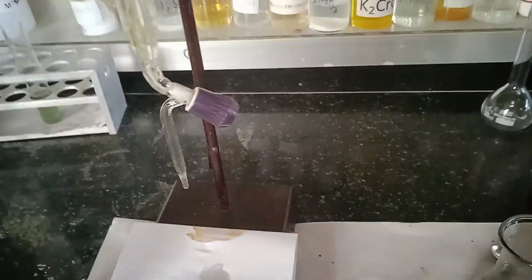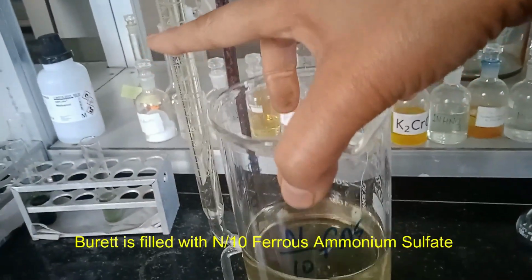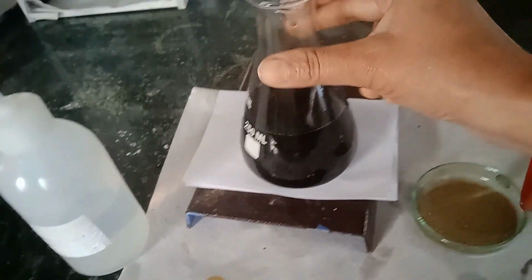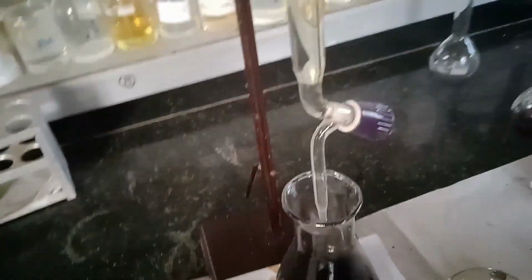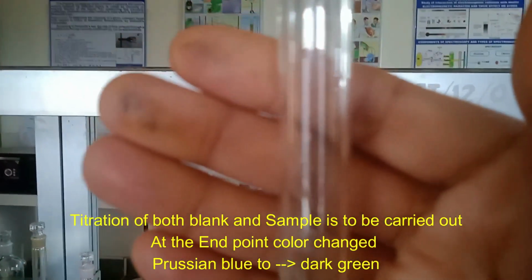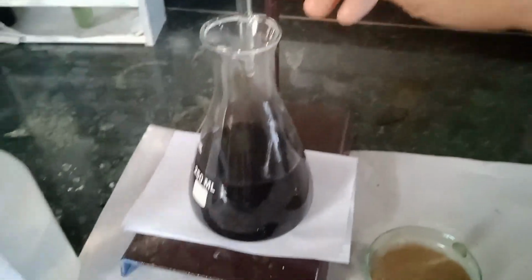For titration, I am using this burette and in the burette I have filled N/10 FAS, ferrous ammonium sulfate solution, because ferrous ammonium sulfate solution reacts with potassium dichromate. Now we see the initial reading. Since 2-3 drops have leaked, it is 0.2 ml. We will start with 0.2 ml as the initial reading. Now we are going to titrate this.